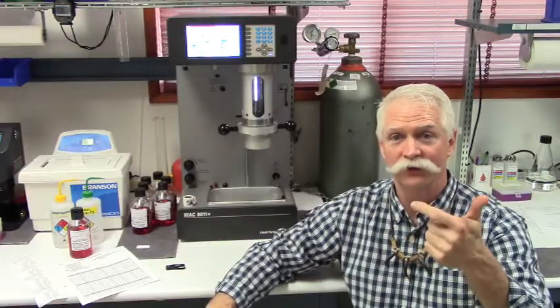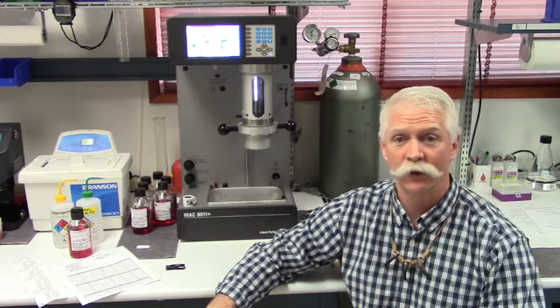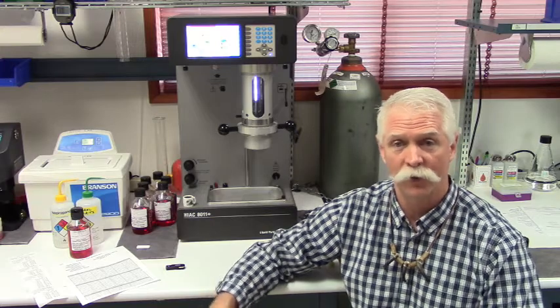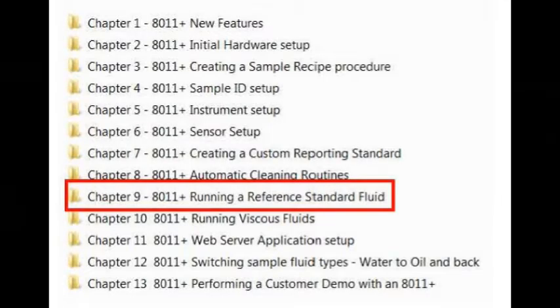So once the instrument's set up, the sensor's set up, and you've created a recipe, now you're ready to run a sample for the customer. So you're going to simply run it just like you did at home to make sure that the instrument is counting properly and performing properly. This is all covered in Chapter 9 of the video series.